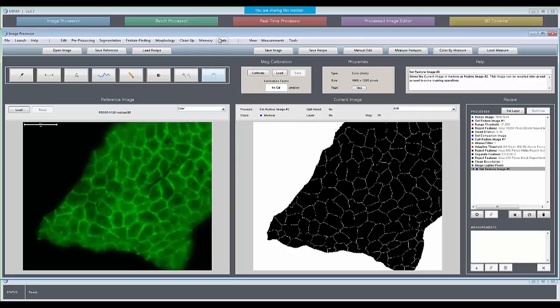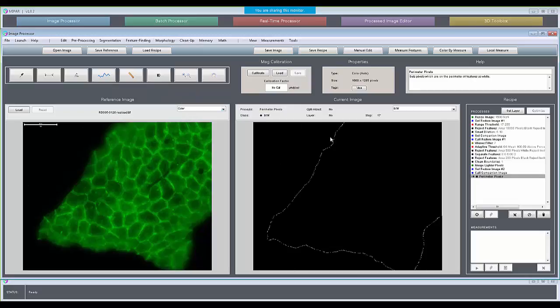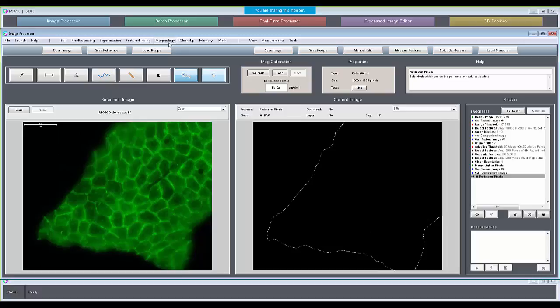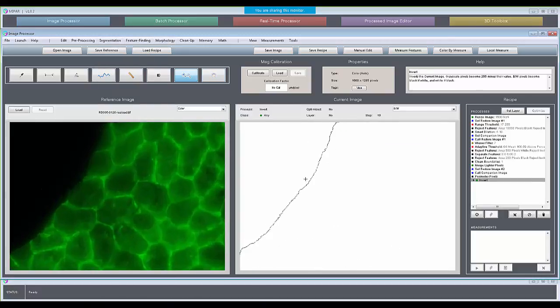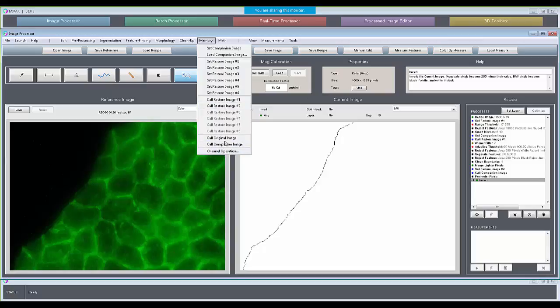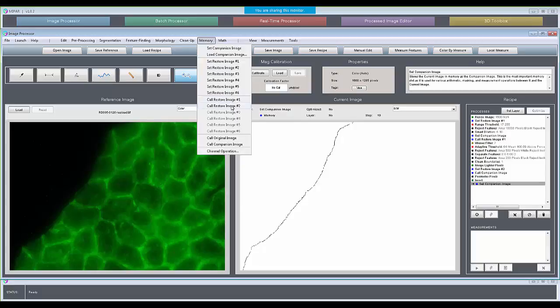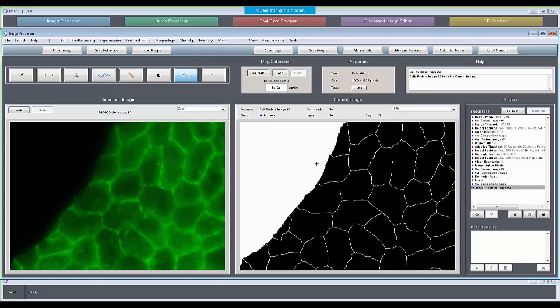Then let's go and bring back our companion image. So let's call companion. We're going to do a perimeter pixels off of that, which highlights the perimeter pixels as white. We're going to invert that around so that they're selected, so that we've got perimeter pixels here. And then I'm going to set this as the companion. And now bring back my cell image, restore image 2.